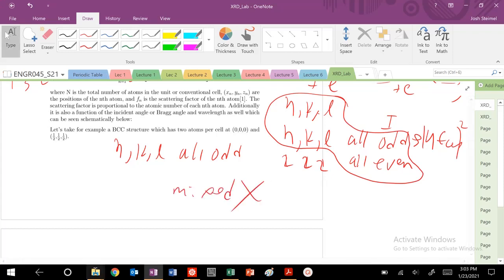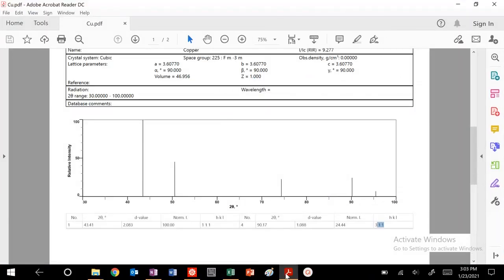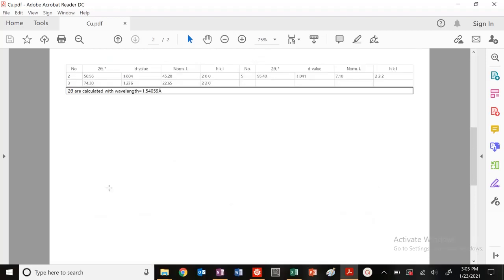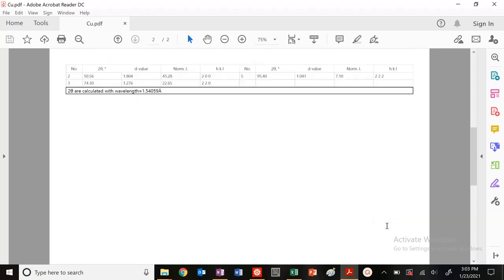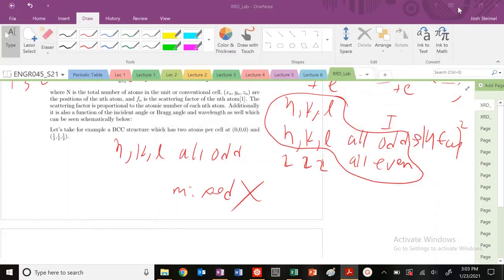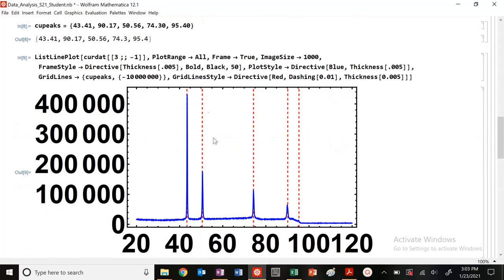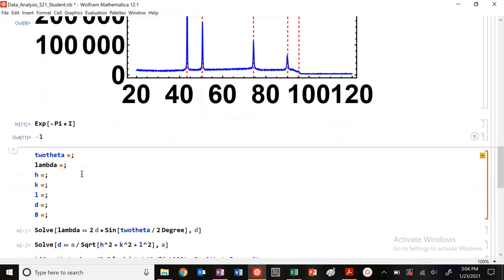Let's see, looking at our international structure database, let's see if that matches. So 1, 1, 1, all odd. What about here? All odd here. What about here? All even, all even, all even. Seems to match. So you're going to want to, in Mathematica or in PowerPoint, label each of these peaks here with their corresponding H, K, and L indices. But that's how you can determine the selection rules.